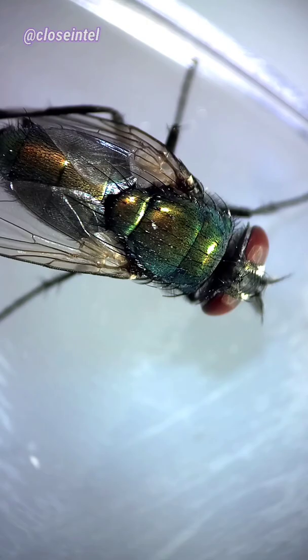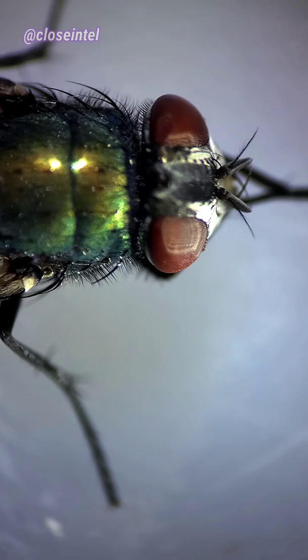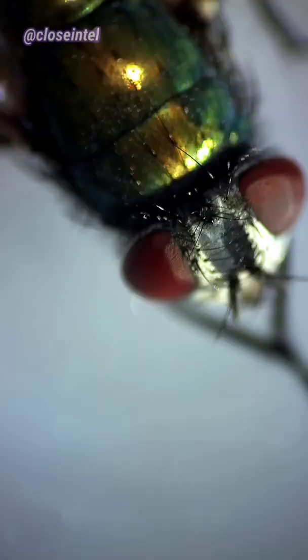This is a green bottle fly, and you typically see them around trash, compost, or anything decaying. They have two compound eyes that are made up of thousands of individual lenses. Their eyes can't move like ours do, but their spherical shape almost gives them a 360 degree view of their surroundings. And they can even see in polarized light.